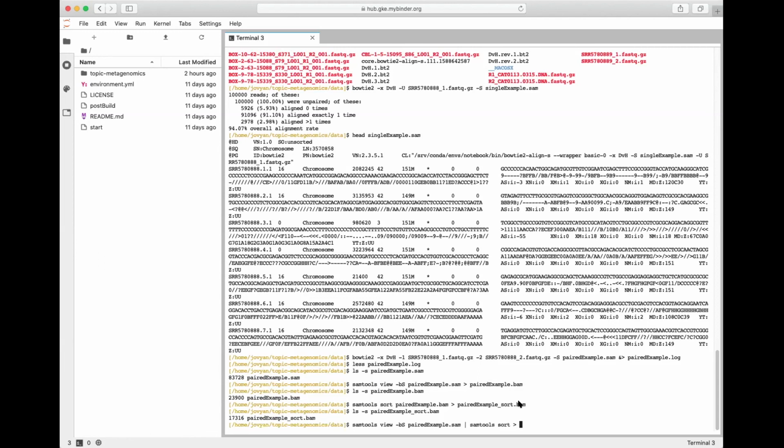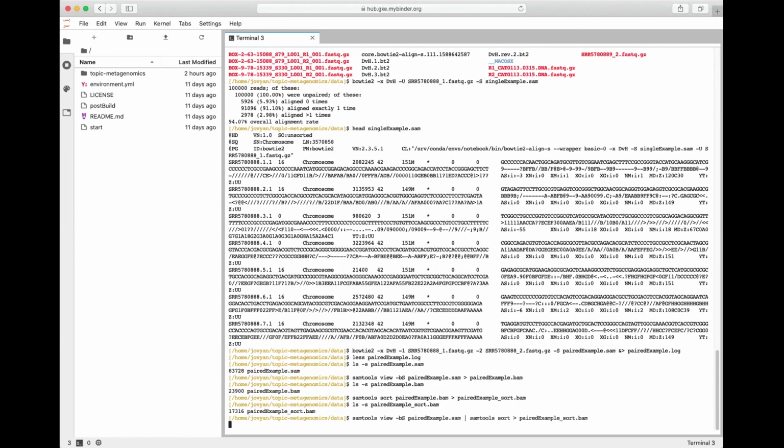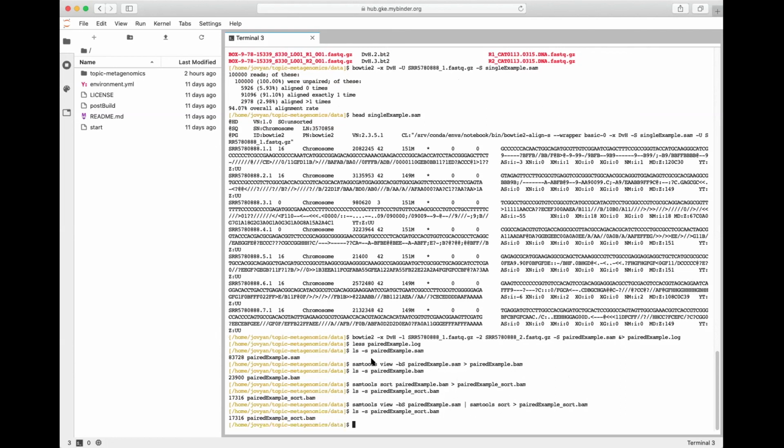And then you direct the output in here. So you could run multiple commands with this pipe, as the pipe just keeps throwing the output of the previous command into the next command. So yeah, we can run this again just to make sure that we get the same file, and it looks like it worked the same way.